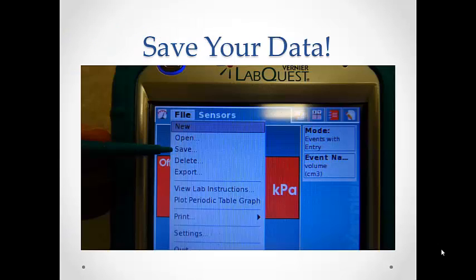When you have finished taking data, save your file on the LabQuest. Just go to File, Save, and give it a name.